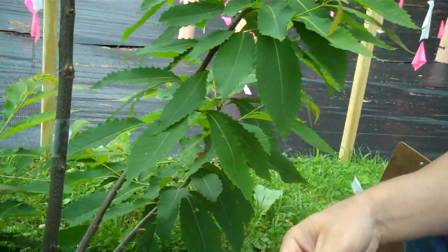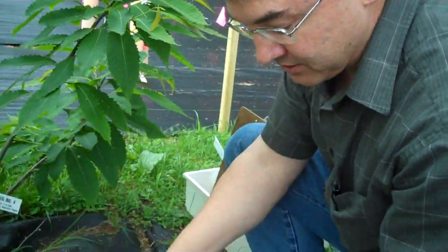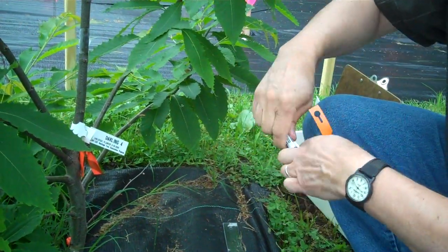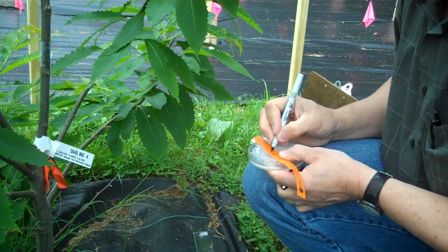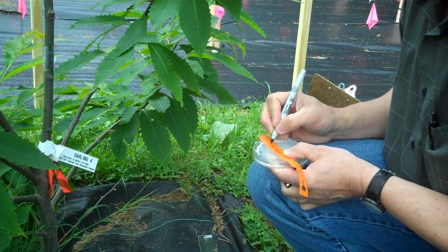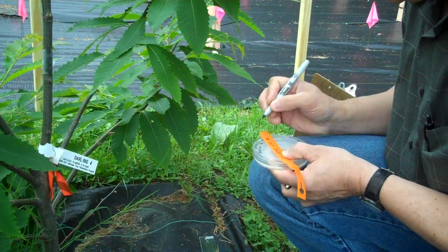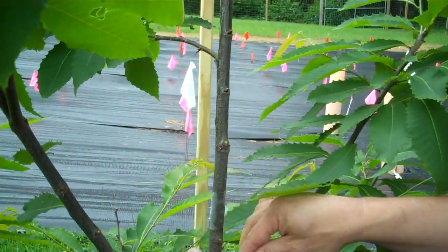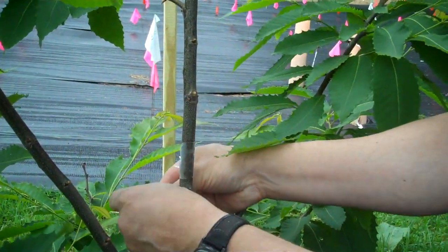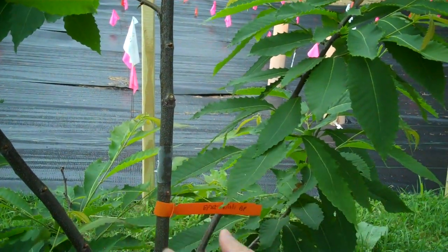That will sit on there for a week, then the parafilm will come off and we'll see if we've got a good inoculation start. For each one we're going to have a tag — this was inoculated with EP155 on 61311 by me, BP. We're just going to tag this so we know where it was inoculated. I'm not putting the tag on too tight, I just want to have it there.